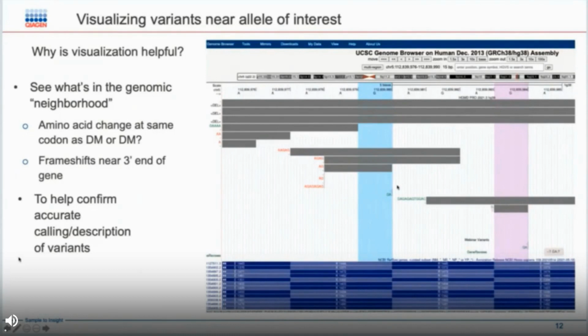And so as a person reviewing this variant and maybe examining the BED file or the BAM, the reads, I might suspect that this insertion is in fact supposed to be called here, a few bases away, downstream.